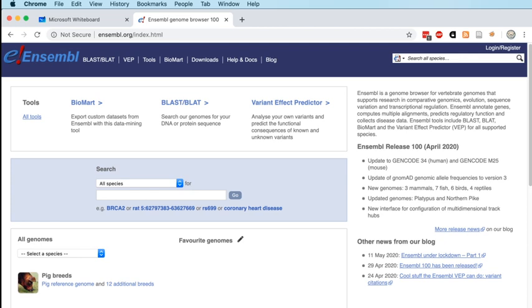We've not really talked about genome browsers or anything like that today. We may think about that in a future lesson. But Ensembl provide a genome browser, so you can go into Ensembl and look at a particular gene and find its genomic location and see what other genomic features are co-located with your gene of interest, and lots of other things besides. They also distribute annotation, so you could download gene sets from Ensembl if you wanted to. We downloaded the GenCode gene set, which is actually very closely related to the Ensembl gene set.